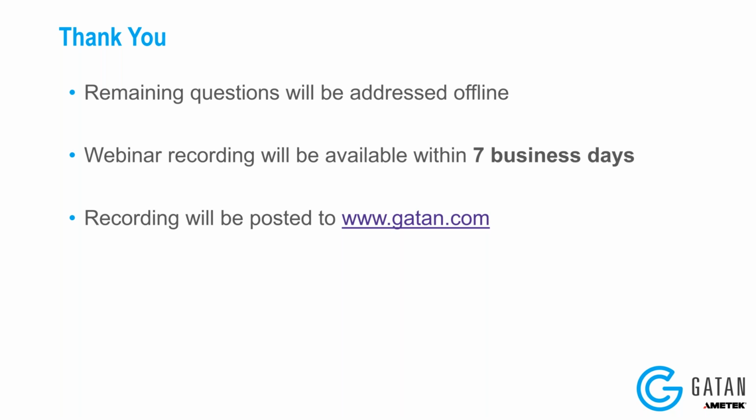Okay, and then the next one that came in is, what is the physical pixel size of this camera? The physical pixel size of this camera is 15 microns. So the pixel size of the ClearView camera and the OneView camera is the same. It was 15 microns as well. And then I talked about the UltraScan and the Arias. The UltraScan was, I think, about 14 or 15, and then the Arias was 9. So you have a larger pixel size and a high amount of pixels with the ClearView camera, which means that you can get a very wide field of view on the camera.